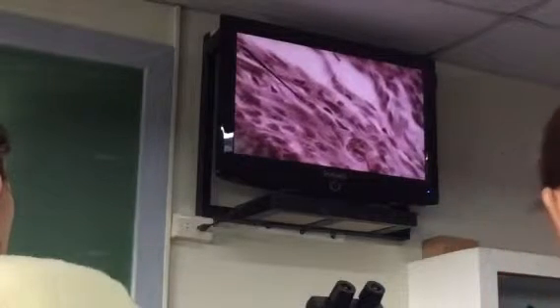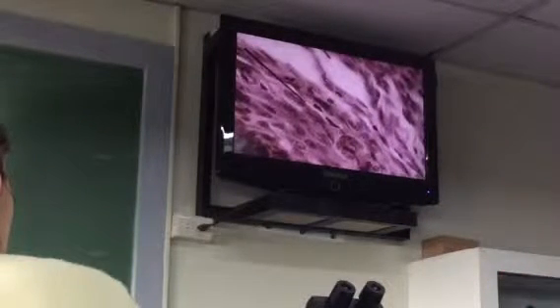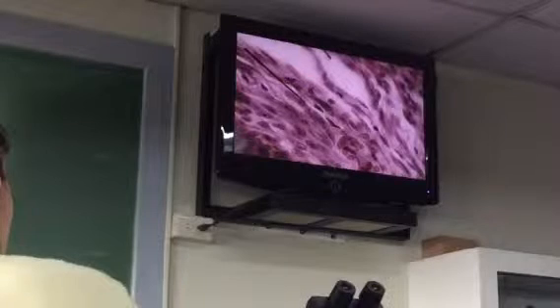Cells are a little plumper, in contrast to the cells here, which are fusiform in shape. This is now your theca interna. Now, externa. Just to remind you, the externa are just made up of smooth muscle and fibroblast, whereas the interna is the one that produces your estrogen, diba?